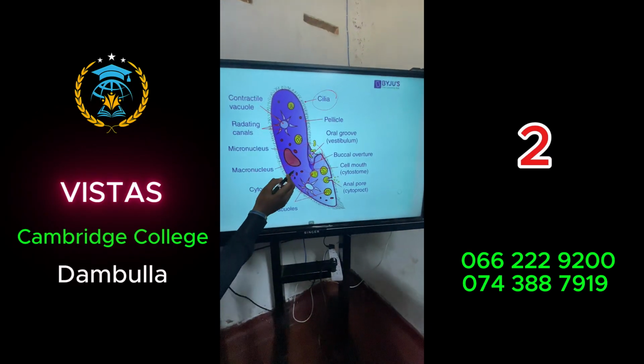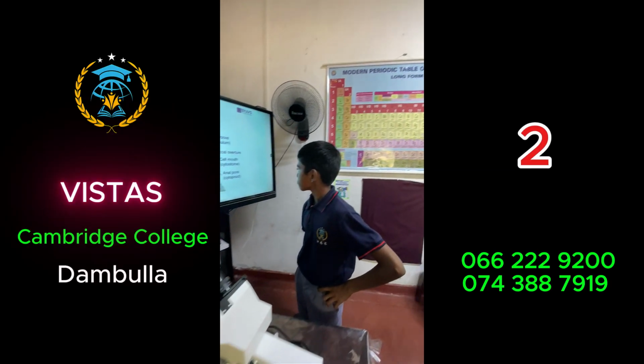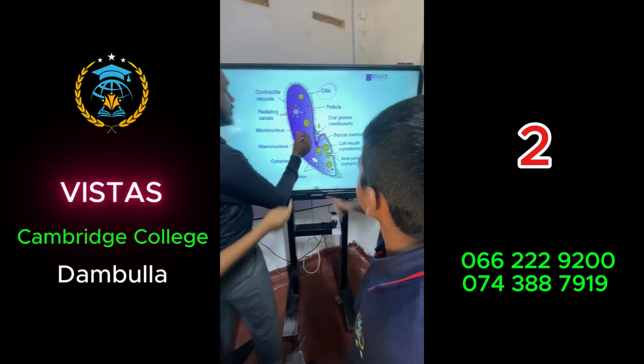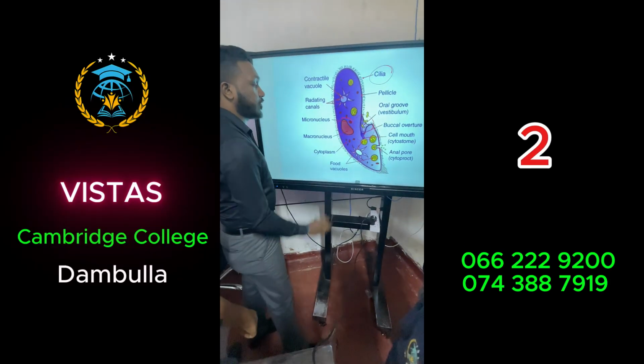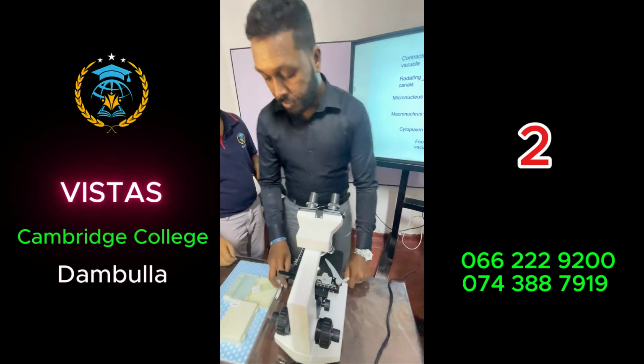Okay, and that's the nucleus. See, yeah, here. These two. Yeah, micronucleus and macronucleus. Just try to identify those things, okay? Okay. We'll place this on.